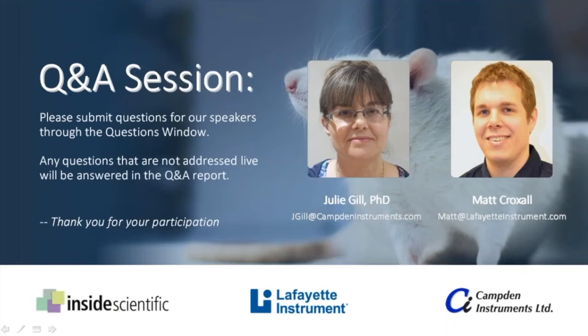Great. Thanks, Matt. Thanks for that additional information. I'm sure that was really helpful. Actually, we did receive a couple comments as you were speaking about wireless integration with wireless head stages and things like that. So I think you've answered that well. And as it relates to the software, are you able to provide our audience with a very quick software demonstration to show what the data looks like when it comes out of the system? There were quite a few questions about that as well. Sure, we could pull up ABET here and take a quick look.